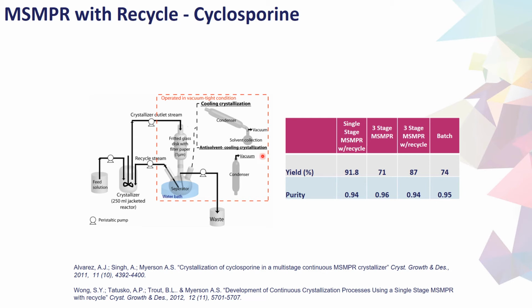In this case, cyclosporine, a relatively large molecular weight small molecule API with a molecular weight of 1,200, was utilized. The system has a lot of impurities that are structurally very similar. Such impurities are often referred to as lattice substituting impurities, as they can partition into the crystal lattice of the product as the crystallization occurs. Due to their structural similarities, this creates a relatively low energy barrier, or means of discriminatory ability, by the crystallization process.